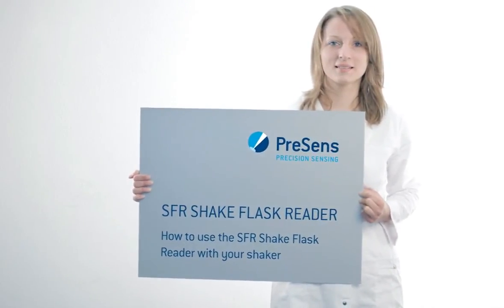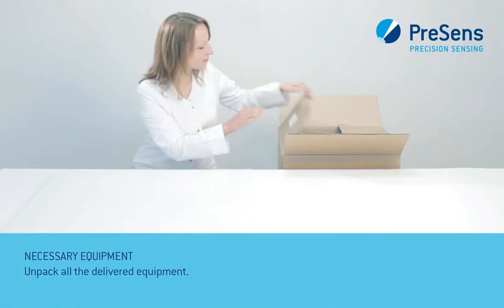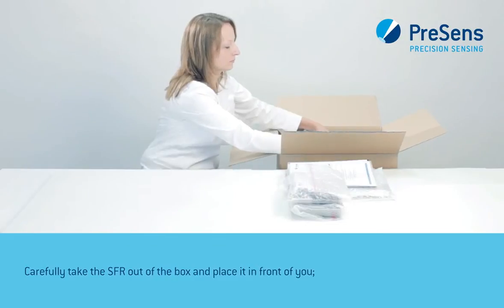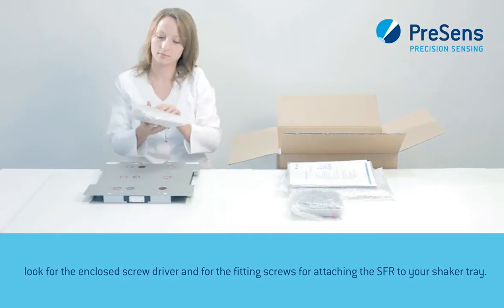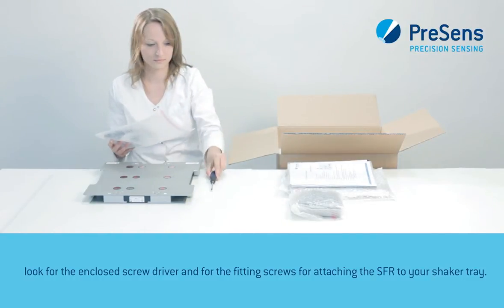Now we will show you how to use the SFR Shake Flask Reader with your shaker. Unpack all the delivered equipment. Carefully take the SFR out of the box and place it in front of you. Look for the enclosed screwdriver and for the fitting screws for attaching the SFR to your shaker tray.